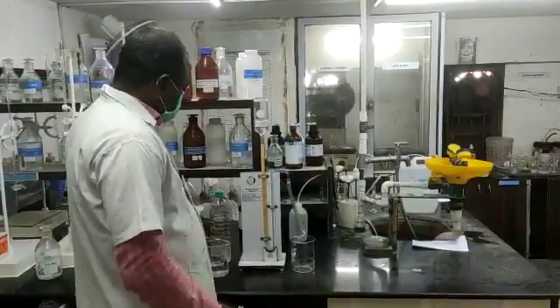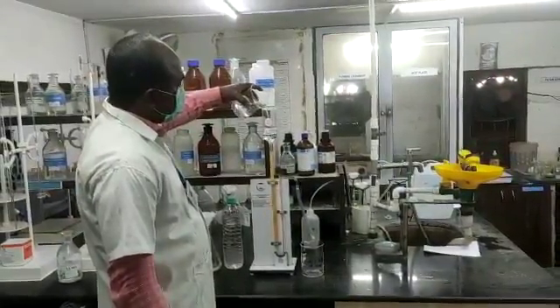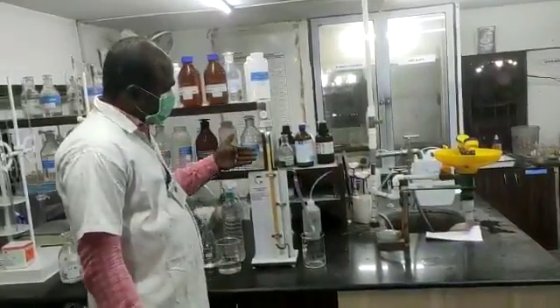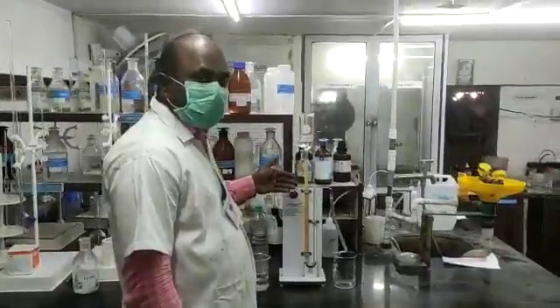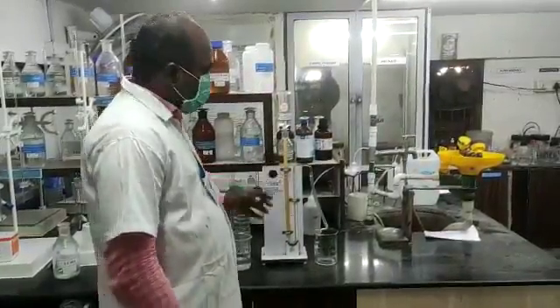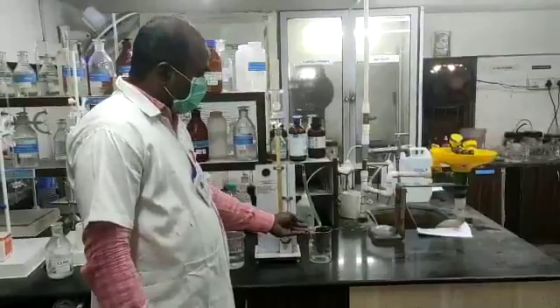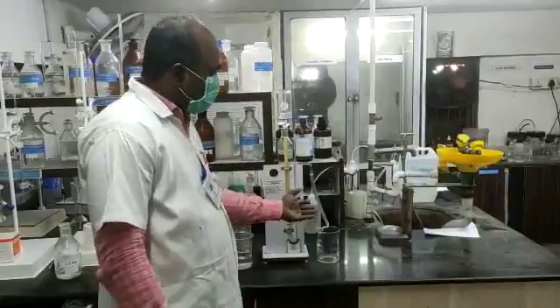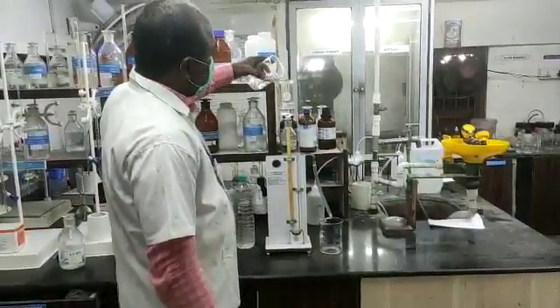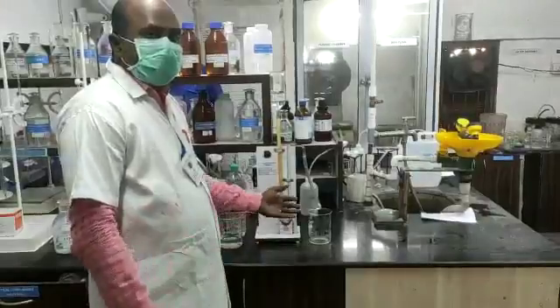Then transfer the water sample to the ion exchange column. Any iron molecules or iron compounds present in the water sample — the cation resin will totally remove the iron content. Then, on the opposite end, you collect all the water sample from which iron has been removed by the ion exchange. Transfer it to a beaker.